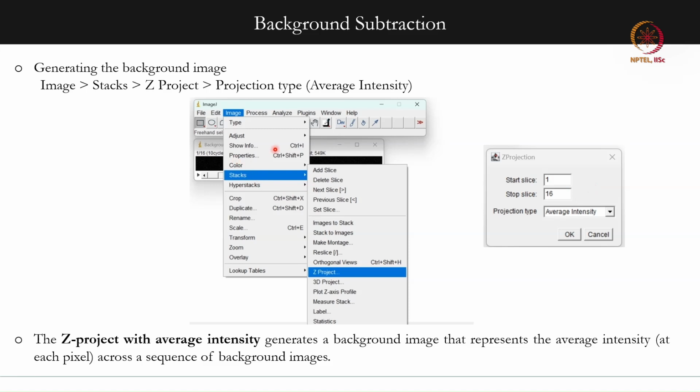So that is what this operation does. We go into the image panel, into stacks, and then Z project, and in Z project we select the option of average intensity. This gives us an average image of all those 16 images where the flame is not present, basically the average of all the background images.